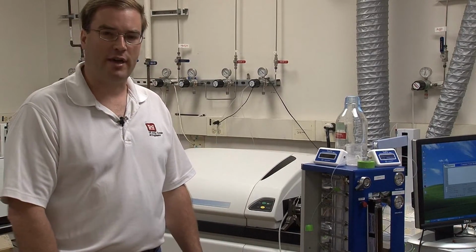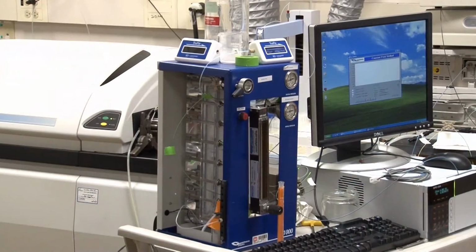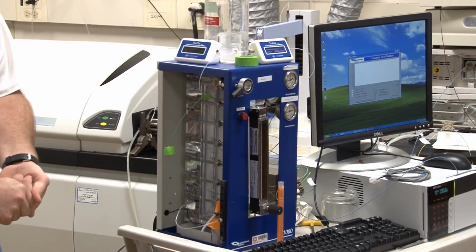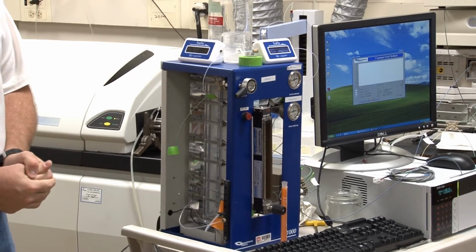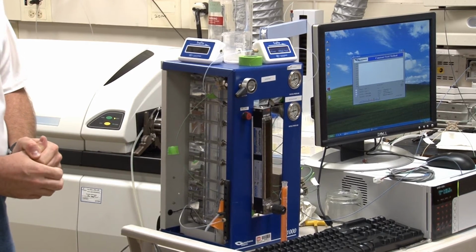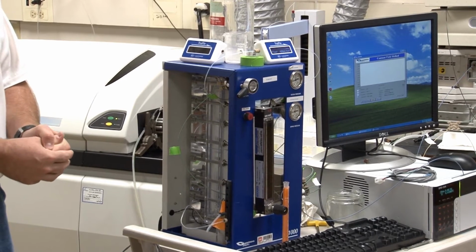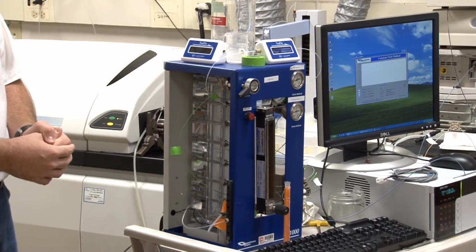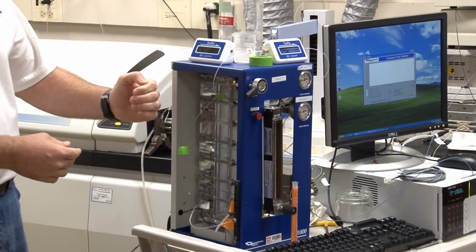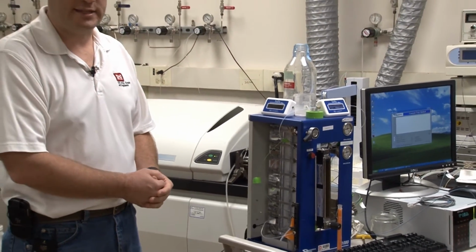In that channel, you have two flows, one going down the channel just like chromatography flow would be. The second flow is perpendicular to the channel, which shoves the particles against the accumulation wall. These particles will diffuse against that force based on size, specifically diffusion coefficient. The smaller the particle, the farther the particles diffuse against that cross flow. Therefore, they get taken up higher in the channel and taken out faster by the channel flow. This gives you the separation based on size.